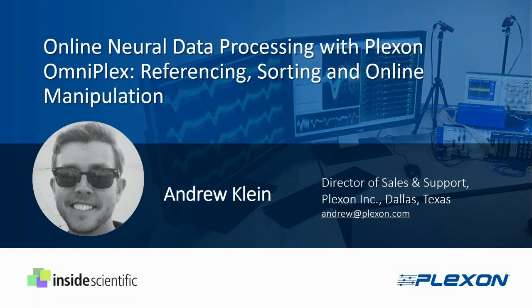Today's webinar will focus on the fundamentals of OmniPlex software, a turnkey acquisition and data management platform for recording neural biopotentials from acute or chronically implanted electrodes in both anesthetized and awake behaving animals.